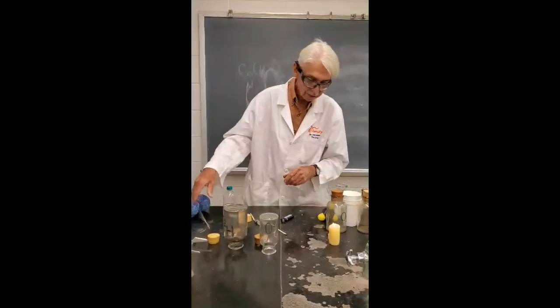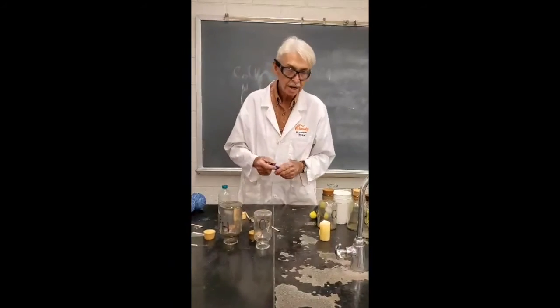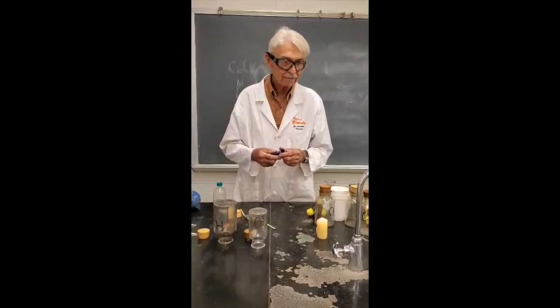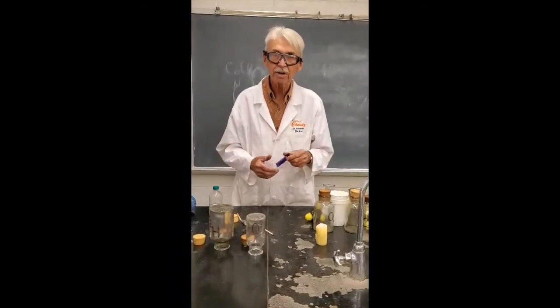Well, anyway, that's our fun with gas. I hope you enjoyed our experiment with fun with gas. Could you tell I was enjoying myself too? Because I love to have fun with gas. I've done this hundreds of times and I still enjoy doing it.